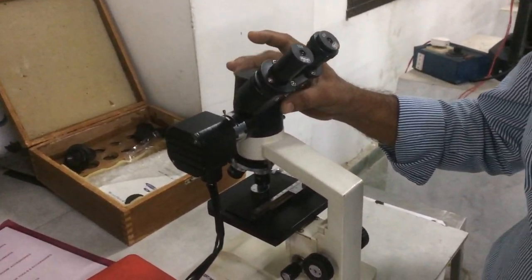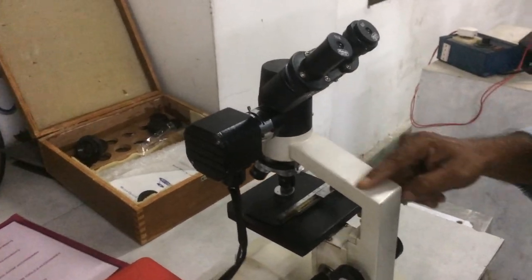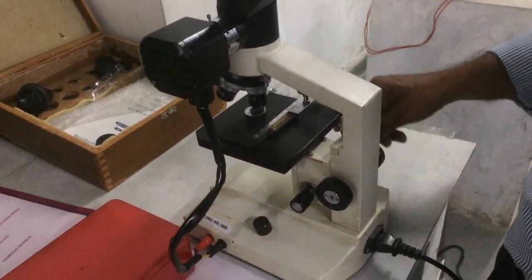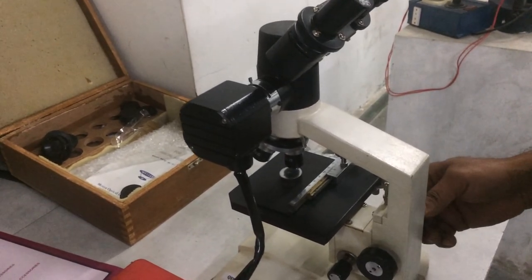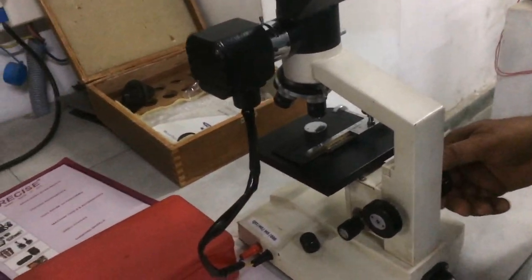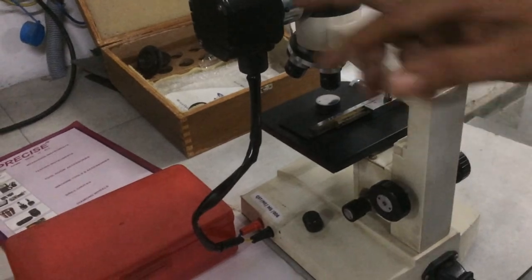This is eyepiece and frame. Then observation tube. This is to lift and lower the object. This is lighting system.